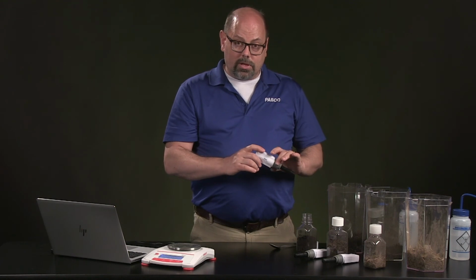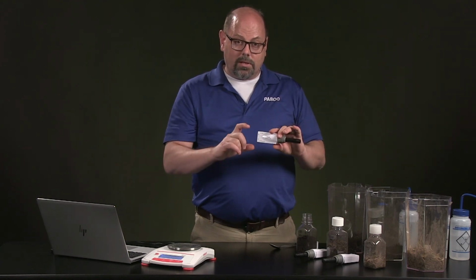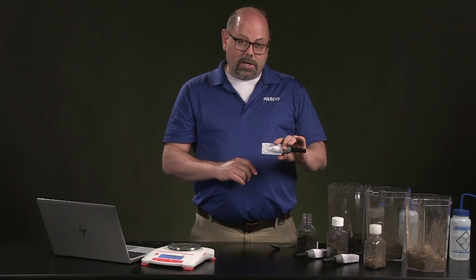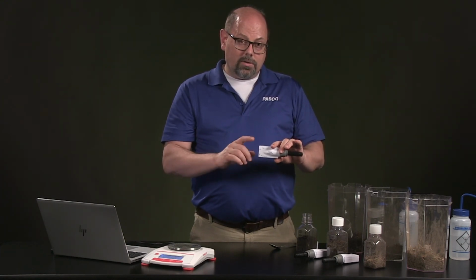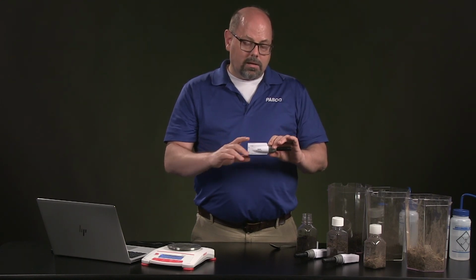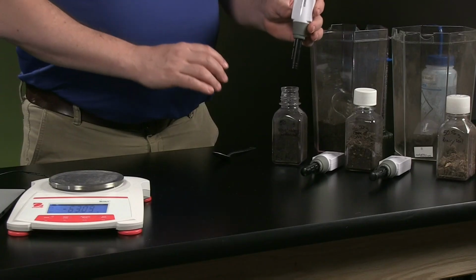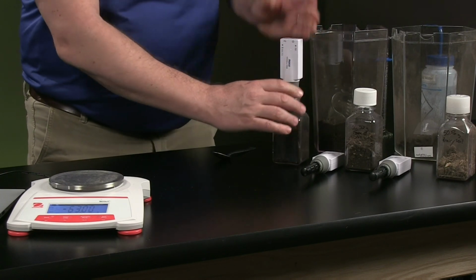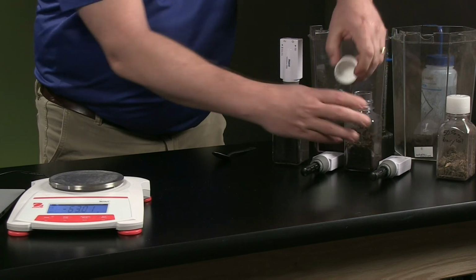And I'm going to let you look those up either with the manual that came with it, the little directions and helpful guide, or you can go to PASCO.com and look under the videos, and it'll describe that process under documents on the right-hand side in the PASCO.com page for this product. So we're going to go ahead and put those down, and I just did calibrate those. We're going to measure that as well.